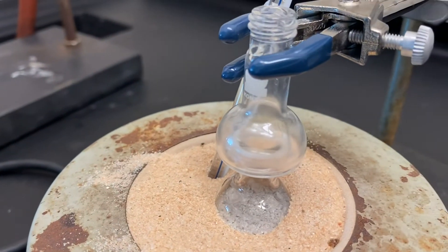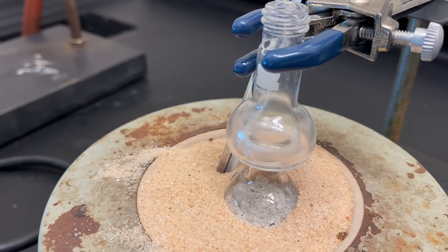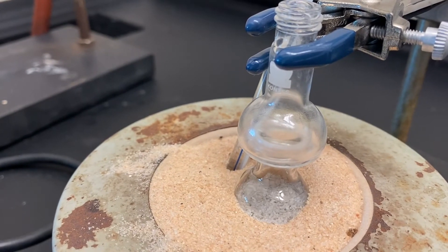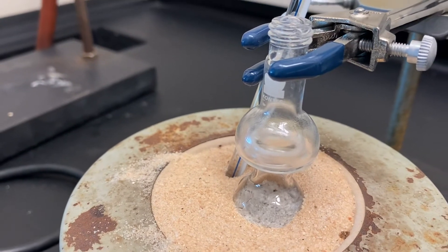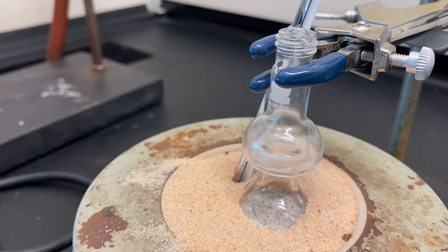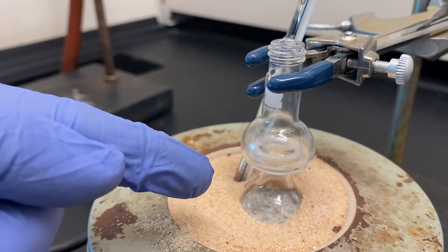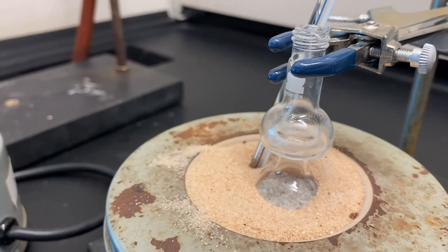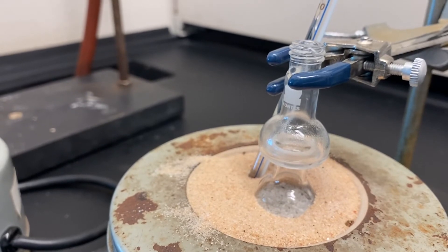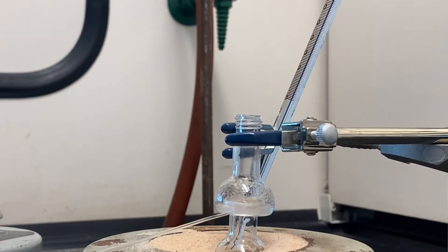I am not increasing the power, but you can see the solution or liquid in the lower bulb is boiling. Slowly the distillation process will start, and you will be able to collect your product in the upper flask or in the collection ring. This is the product you have been collecting.